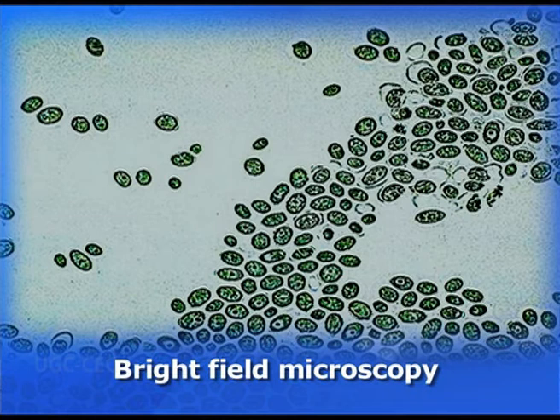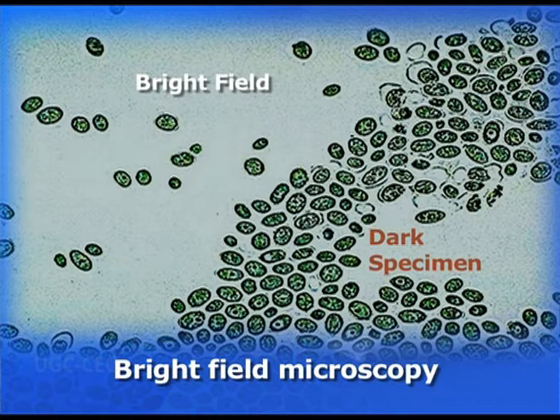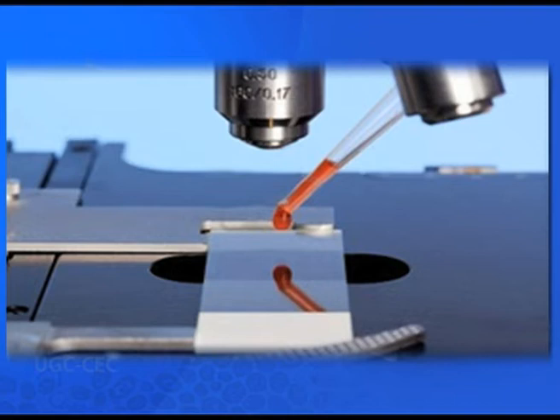This type of microscopy we have studied is also called bright field microscopy because the field is bright while the specimen we are trying to observe is dark. Bright field microscopy has its limitation because of the fixed wavelength of light and a limit of numerical aperture. Apart from this, it does not offer sufficient contrast, due to which we have to use stains to develop a contrast in the specimen.